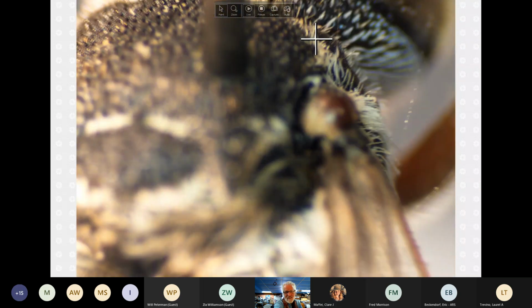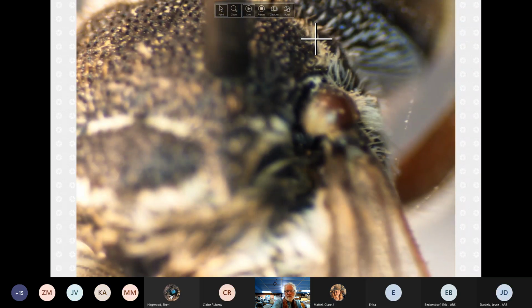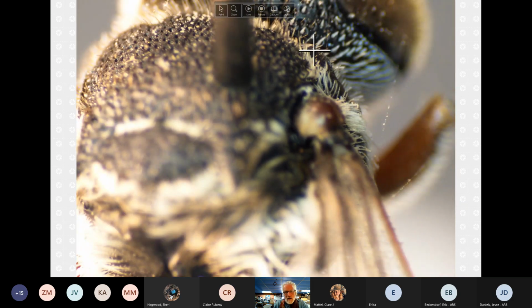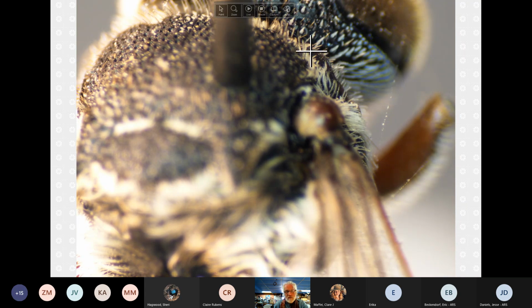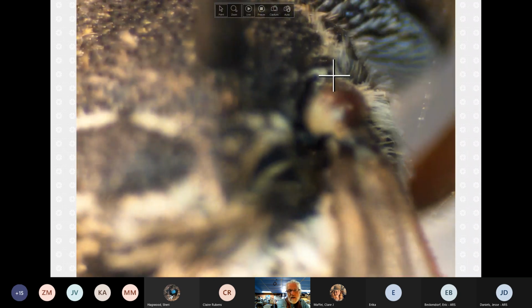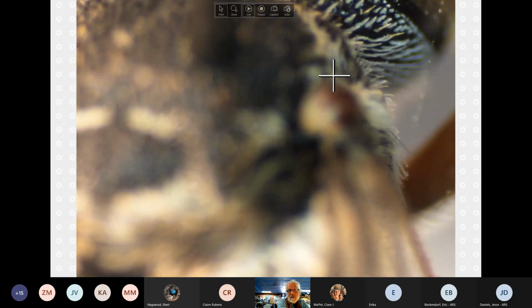It is. Okay. So in this case, what we're looking for is a pronotal ridge, or flange in this case, projecting above the surrounding hairs. There it is, clearly up and above the edge where we couldn't even find it last time. So I think that's relatively clear.